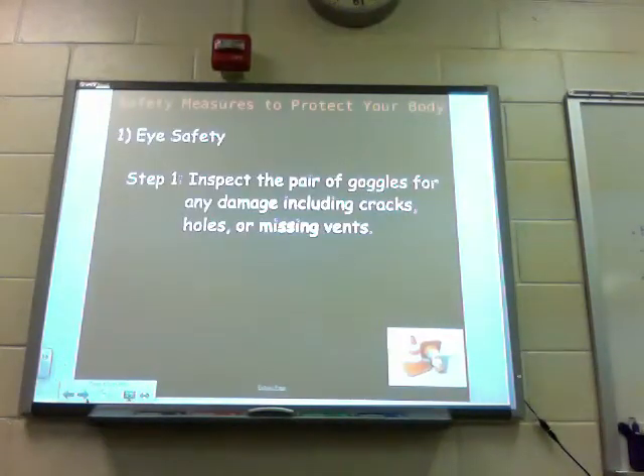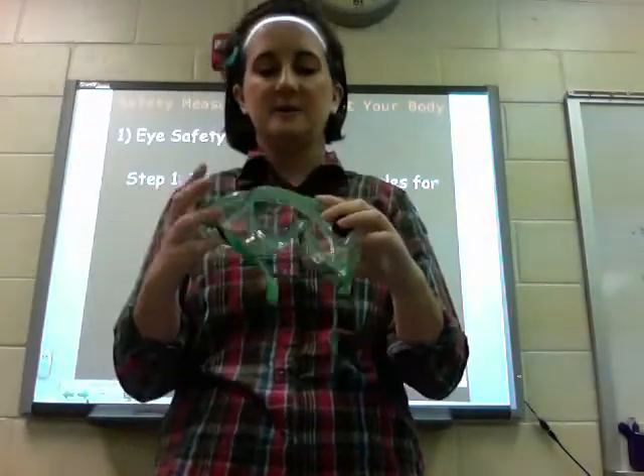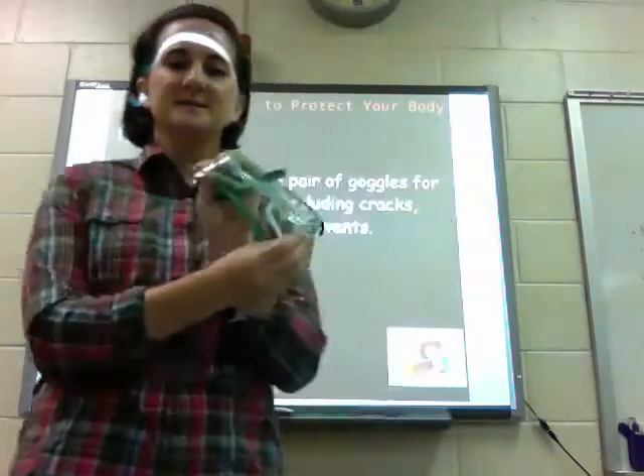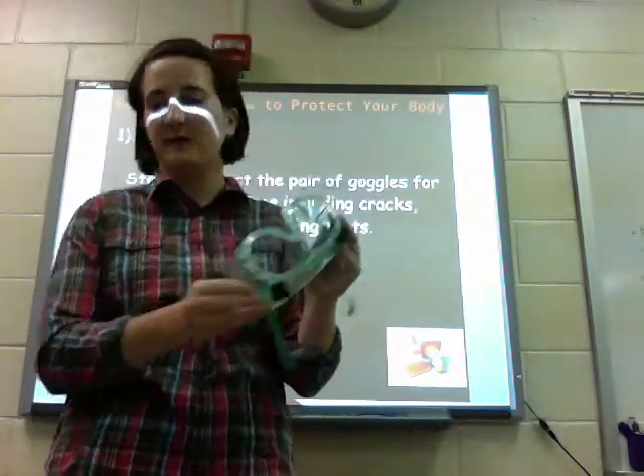We're going to start today with eye safety — very important. Step one is to inspect a pair of goggles for damage including cracks, holes, and missing vents. Here's a pair of goggles. We see two vents on the back side. We have two missing vents. Anytime you have missing vents, cracks, or holes, you need to get a different pair of goggles.